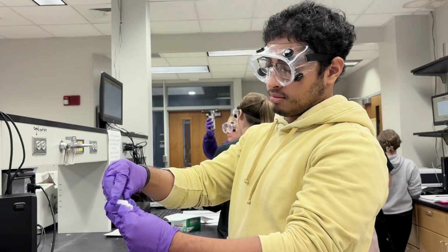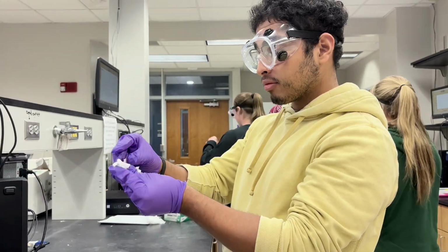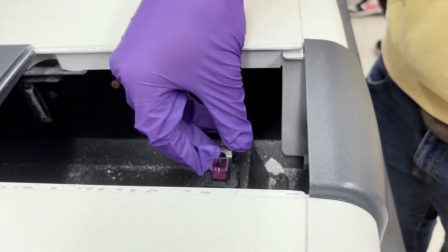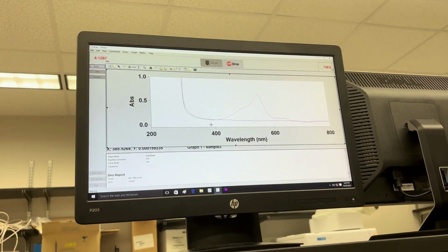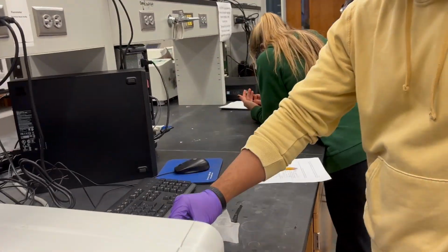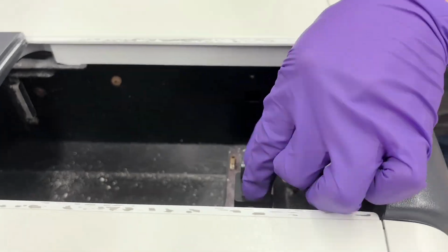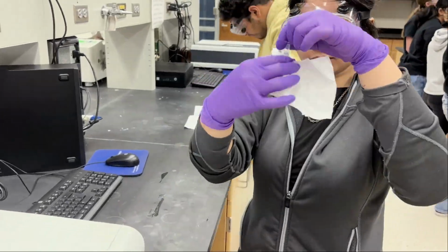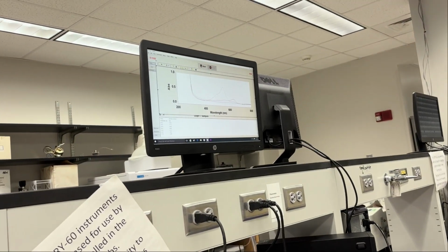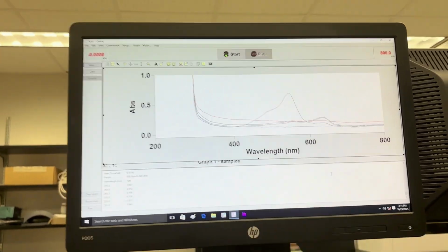to calibrate the instrument. Once the machine reads 0, we open the lid, remove the blank, and then we prepare the first sample by wiping the clear sides again, ensuring they're clean, and placing the cuvette into the spectrophotometer with clear sides facing the light path. We close the lid and press scan. When the reading appears, we record the absorbance value, then we remove the cuvette and clean the area if there's any solution that has spilled, and then we repeat the process with each remaining sample.